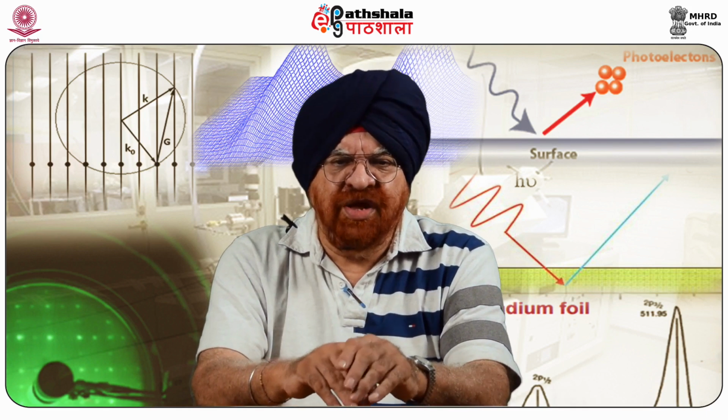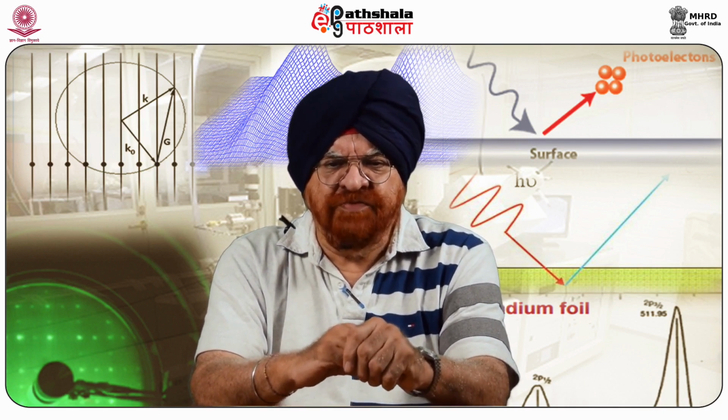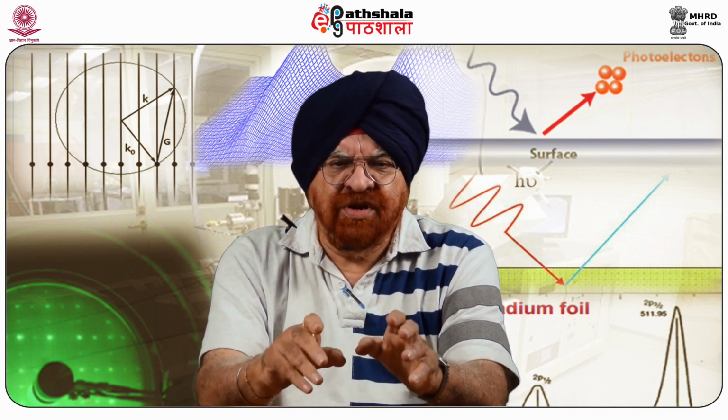The amplitude change is monitored and regulated by a feedback system to keep the tip sample distance constant at a predetermined set point.